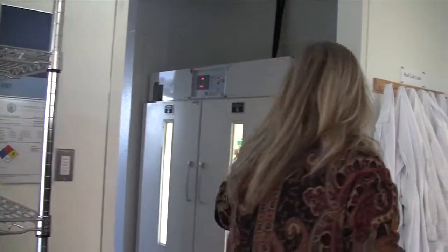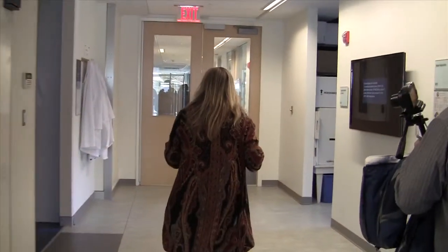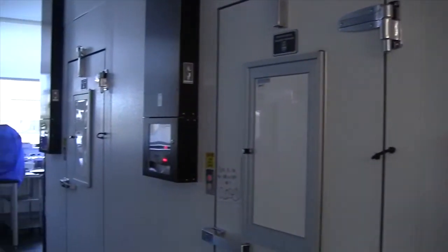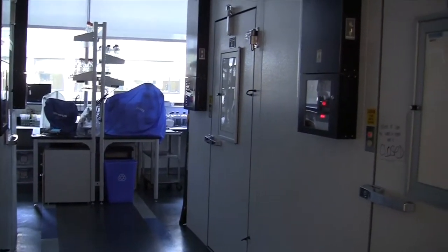These chambers, we're not going to go in there right now, but if you come down a little further, you can kind of see that each one of them operates independently of the other. In the back is where the curators work. They literally take individual samples, put new medium in, and grow them at the different temperatures. If anything goes wrong, alarms go off, beepers go off. They need to keep the algae going.